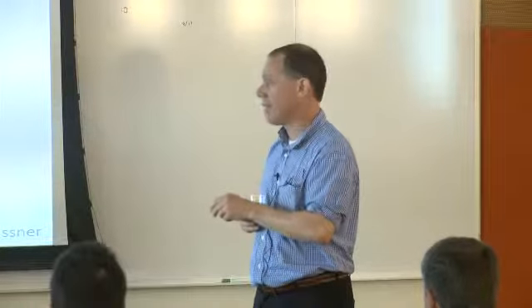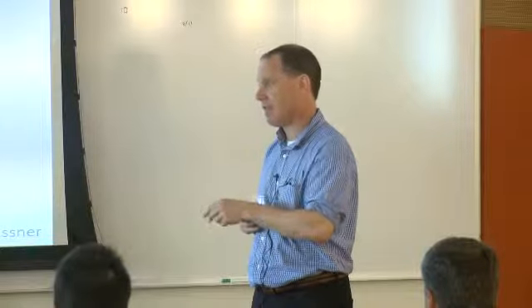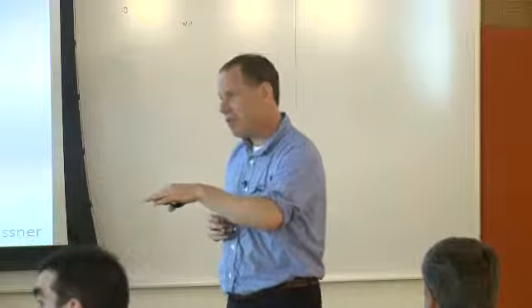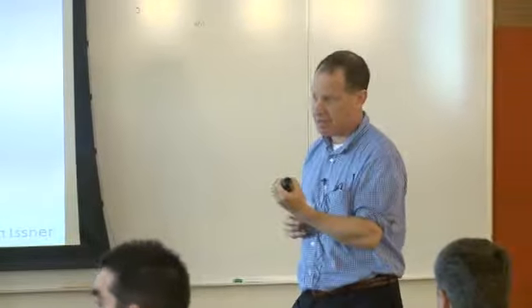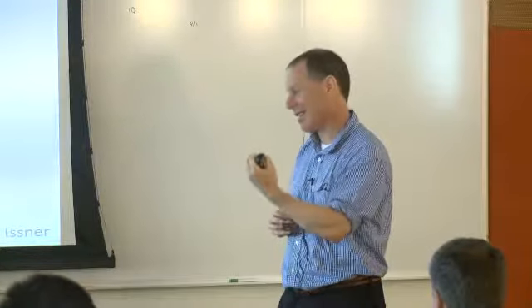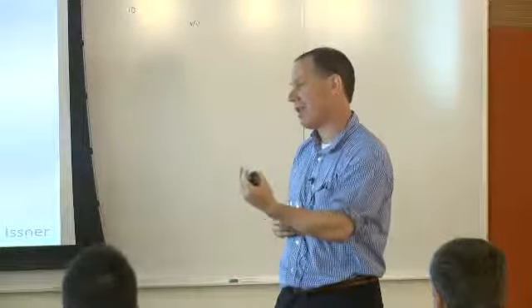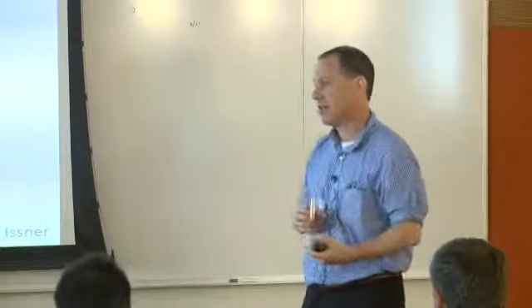This is not part of the workflow of the ChIP experiment itself. Is that clear? So in your workflow, you usually do RNase? Yes, in the actual workflow, after you've done the pull down, I'll get to that in a minute. As part of the elution step, there's the reverse cross-linking, by putting the material at 65 degrees for 5 hours to overnight, and during that time, it's in the presence of RNase and protease. Okay.